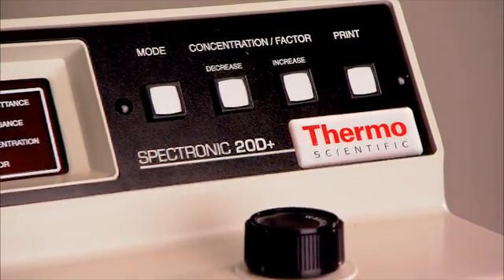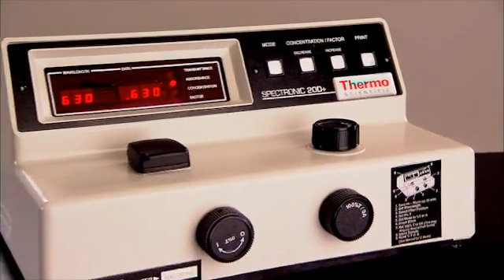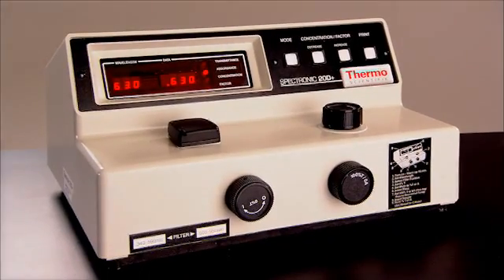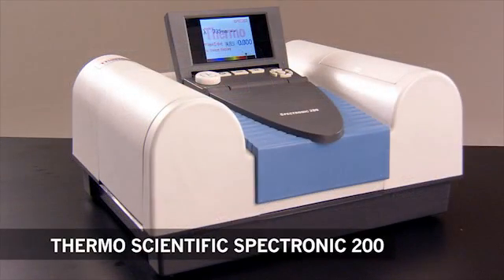Based on the Thermo Scientific Spectronic 20, the most popular instructional spectrophotometer of the last 50 years, the Thermo Scientific Spectronic 200 will become the new standard of the 21st century teaching laboratory.